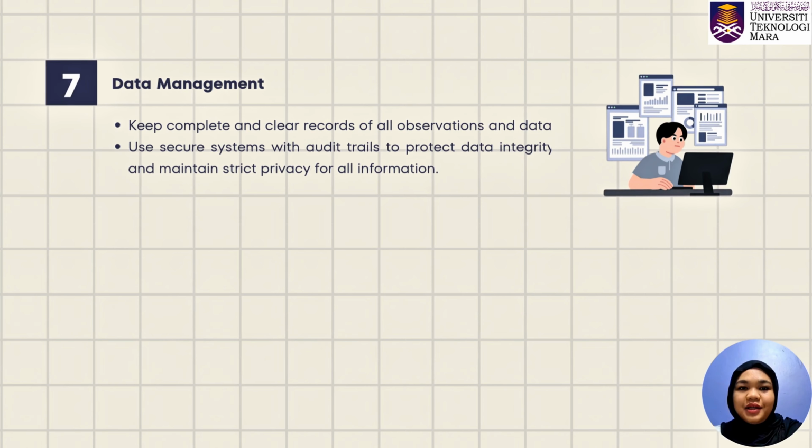Number 7. Data management. Keep complete and clear records of all observations and data. Use secure systems with audit trails to protect data integrity and maintain strict privacy for all information.